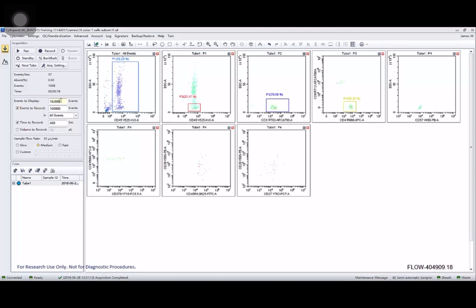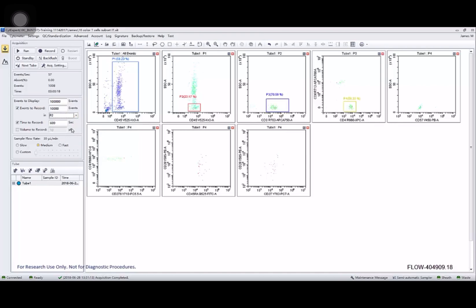I'm going to display a few more events for while we're running these. And I'm going to record 10,000 events that fall through the lymphocyte gate, which is P2 here. I'll leave my pump speed at medium and go ahead.